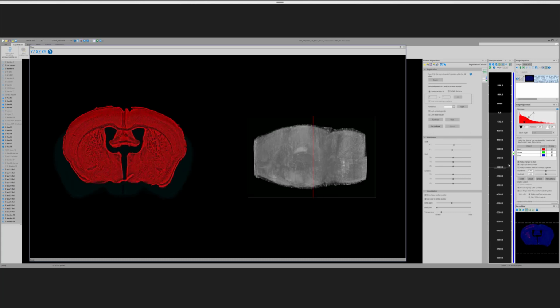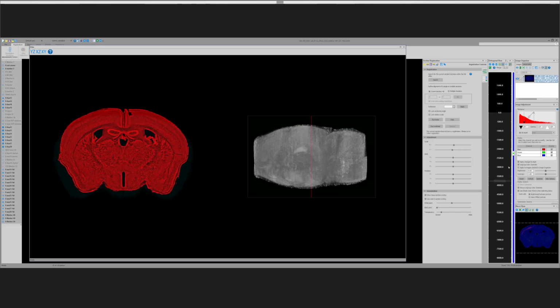What we're looking for is to try to match, as Nate described, the strategy behind registering a brain that's been reconstructed in this way to the Allen coordinate system: the sections that we cut are not perfectly orthogonal to the 2-photon block-based imaging that was used to generate the Allen space.